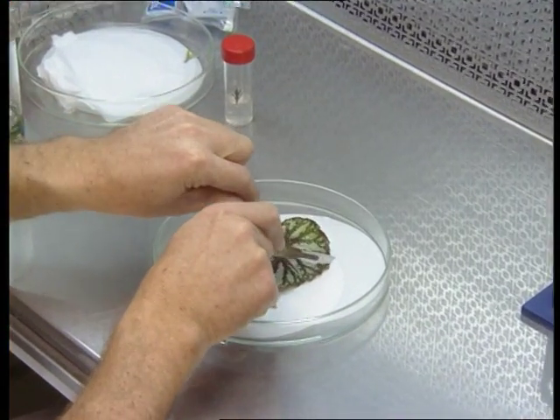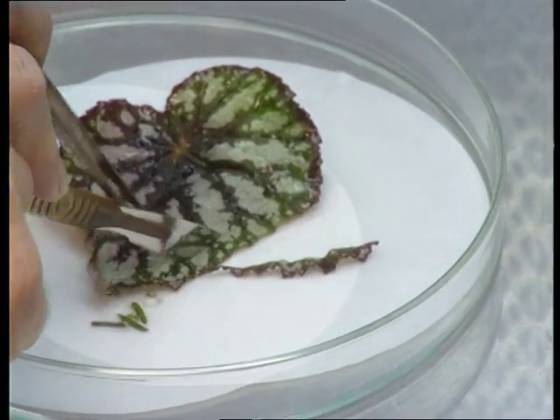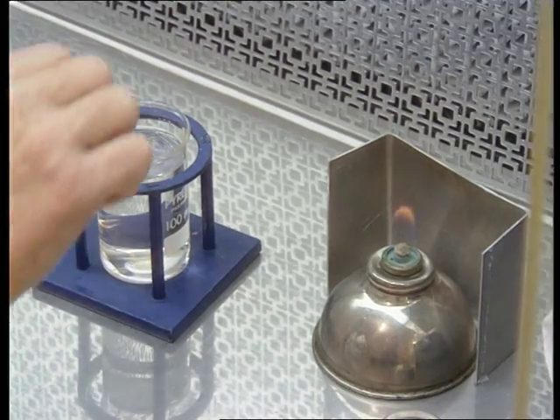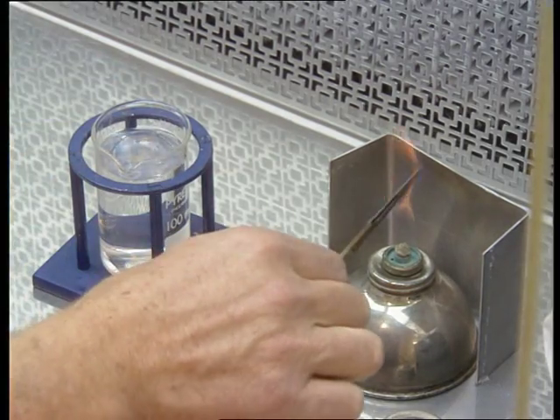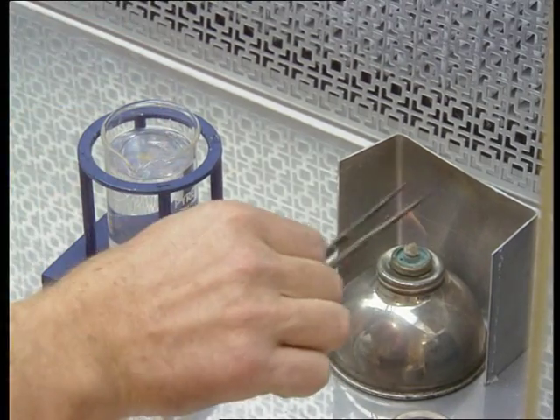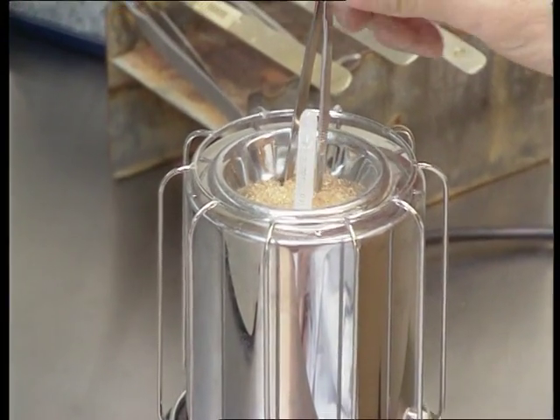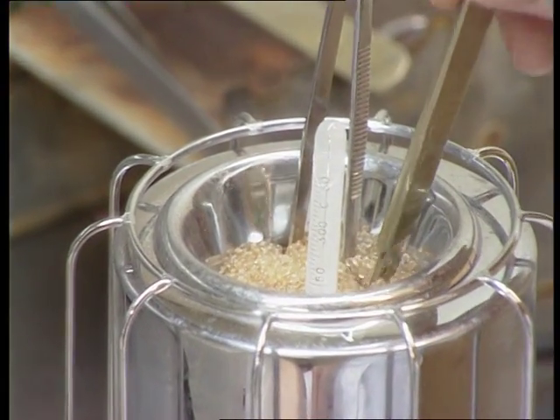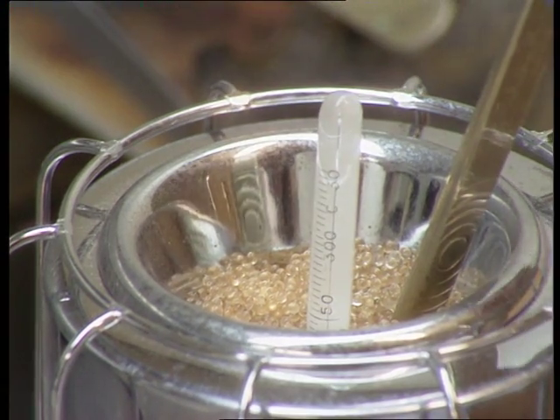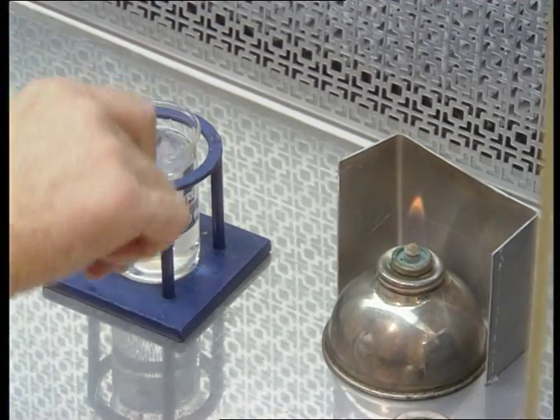In other cases, leaf segments, petiole segments, or root segments may be cut following the same instructions. All dissecting instruments need to be sterilized between cuts. To do that, we can flame them in 70% alcohol and then allow them to cool, or we can use a bead sterilizer like this one here. The bead sterilizer heats a series of glass beads to 250 degrees centigrade, and we only need to insert the instruments for about 5 to 10 seconds to kill any microorganisms which may exist on them.